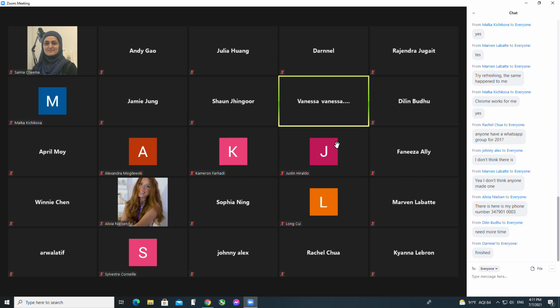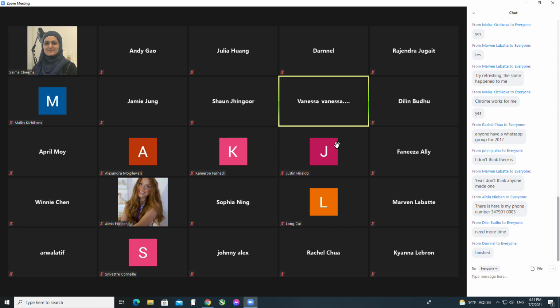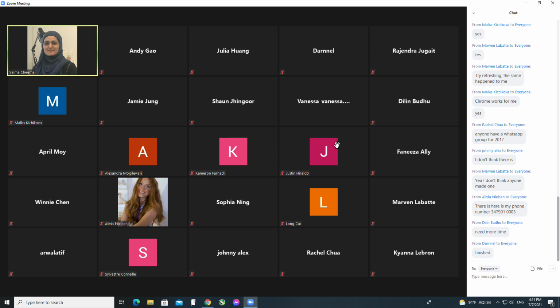Professor, yes, Vanessa. Sorry, are we supposed to be working on part 2 of the Google Classroom activity, the one with the pollen grain and the diatom? You can start working on it, but did you calibrate the ruler already?